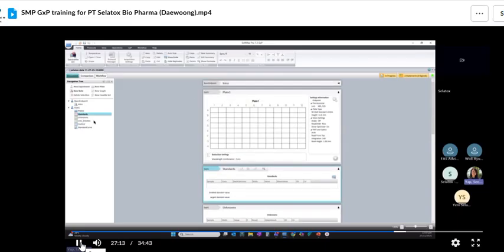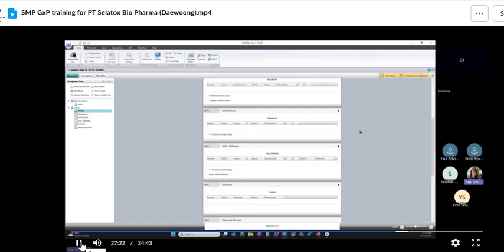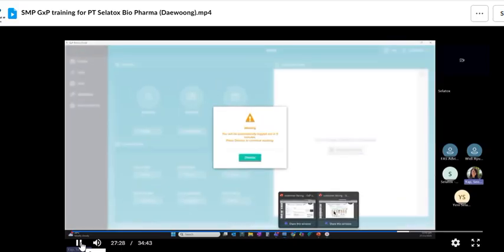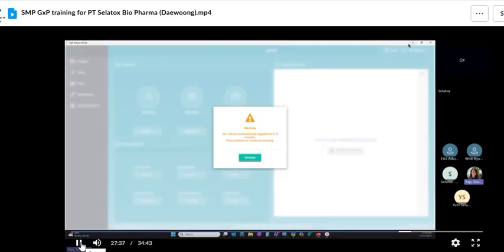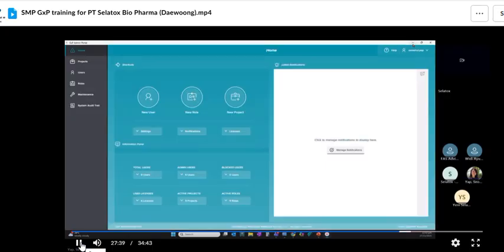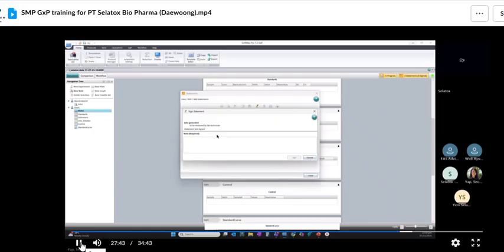Okay, you as a lab technician, right? You just connect to the instrument, the plate readers, run it, and then make changes or formula if needed. All right. Then if you're happy, you want to ask manager to approve, right? Once you've done your experiment here, you want to ask lab manager to approve, right? Then you sign off and then change the in progress to approval pending. Okay. So go here, statements, sign off.